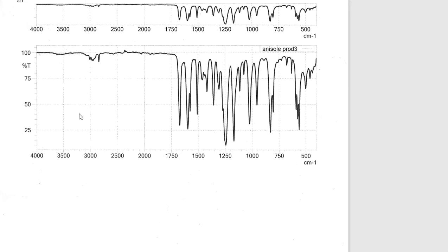crystal. And just like in the last video, we put a few crystals on the center of the diamond and had it analyze it. And this is what we ended up with. This is what it looks like. So this is the anisole product that we're going to end up with.